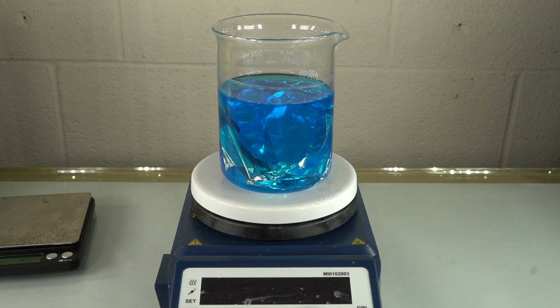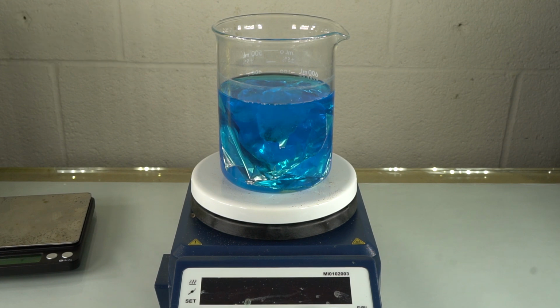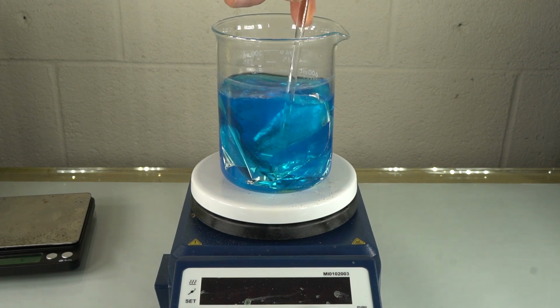So what we're going to do is add some salt. You don't need much, just a little bit of salt. But what that does is the chloride ions act as a catalyst, but they're not really a catalyst. They're not speeding up the rate of reaction. What they're doing is... I'm just going to mix this up a little bit.